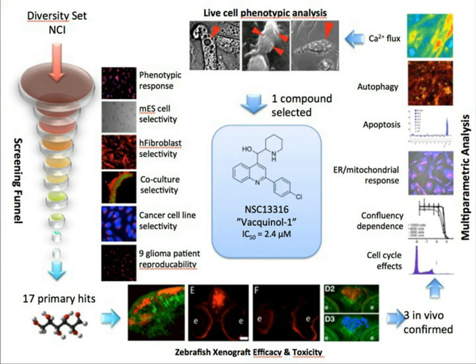And these were further evaluated by various cell-based assays where we evaluated cell cycle, toxicity, efficacy, effect on mitochondria, apoptosis, autophagy, and so on and so forth. We then turned to image-based analysis of these effects using Operetta to see what exactly happens during the course of compound addition and after a while after the cell is exposed to the compound.